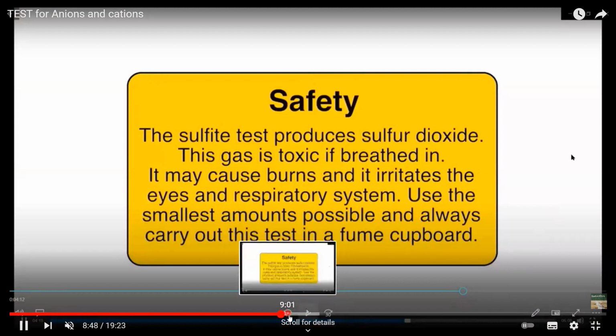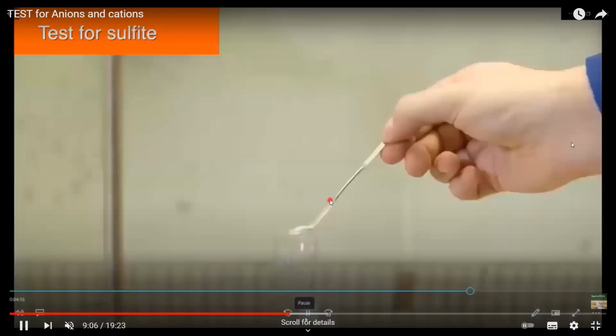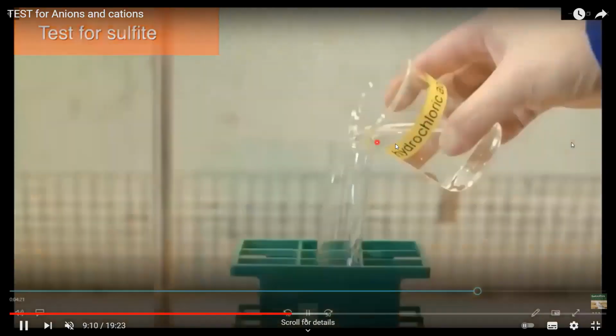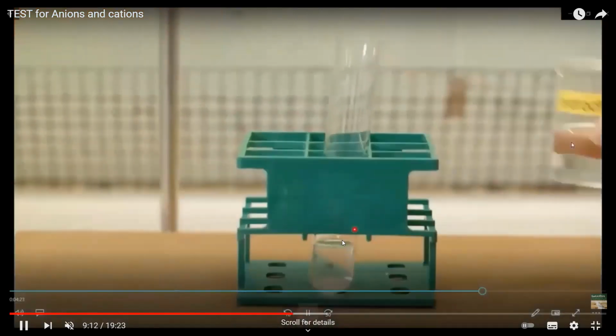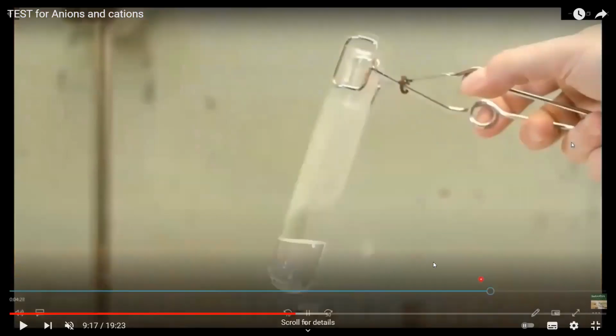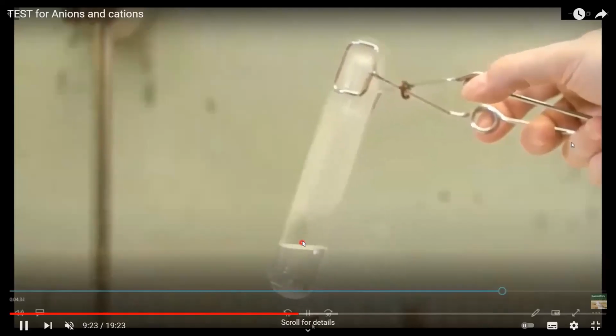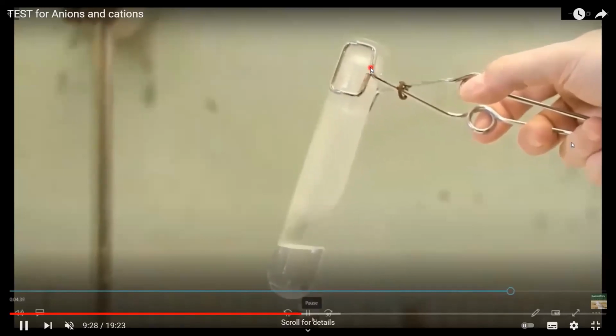So if you want to identify the sulfite ion, first we should make a solution. So we have a sulfite salt solution. Sulfite means SO3. We add hydrochloric acid and then we will heat it. We add hydrochloric acid to a sulfite, and sulfur dioxide is a toxic gas, so it should be done in a properly ventilated room or a fume cupboard as a safety precaution.